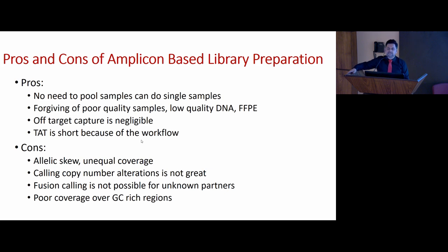There are certain regions of the genome you need to be aware of. You can do something called increased tiling, that means design more amplicons for that. Typically CEBPA, SRSF2, U2AF1, these are all regular suspects where you will get high GC content, and these regions will cause you trouble. Go back to your assay and take a look. Yes, you will find that, oh, this does give a problem.